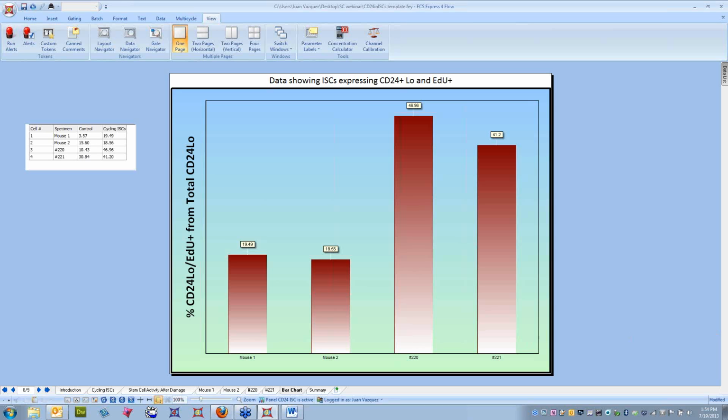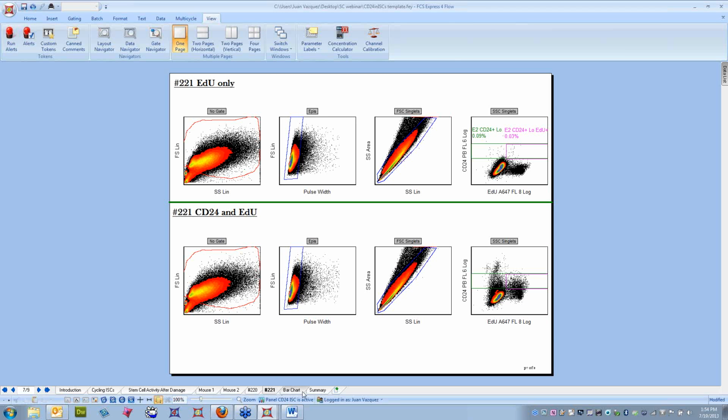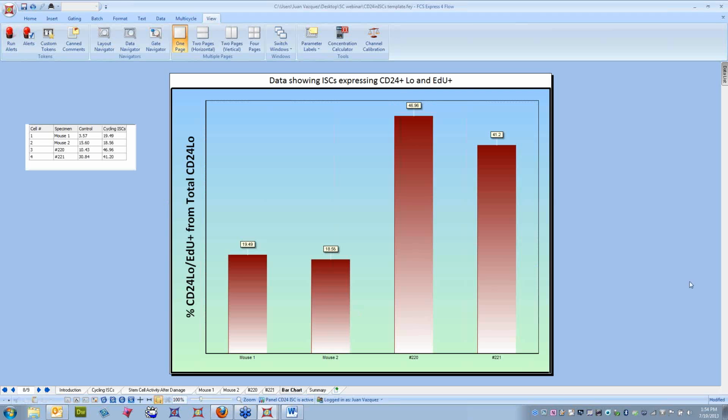And then, with this bar chart here, I think the really nice thing is that we can quickly convey this point. Just glancing at these bivariate plots, it may not be so convincing. I think it would be great to accompany the bivariate plots with the bar chart, because obviously we don't want to mask any data or anything on the plots.